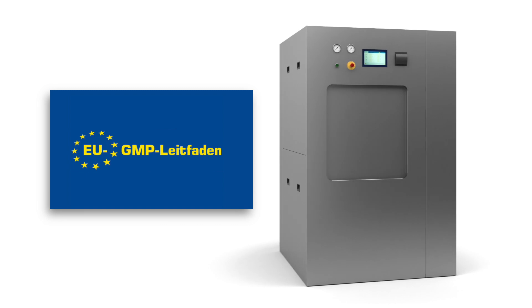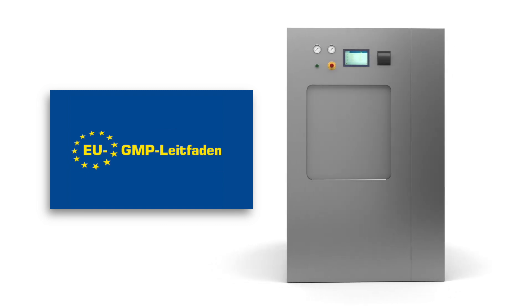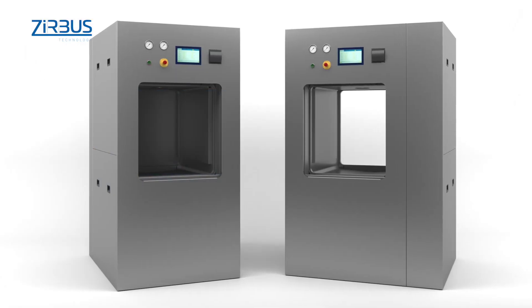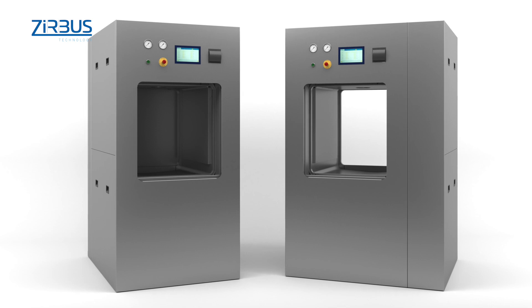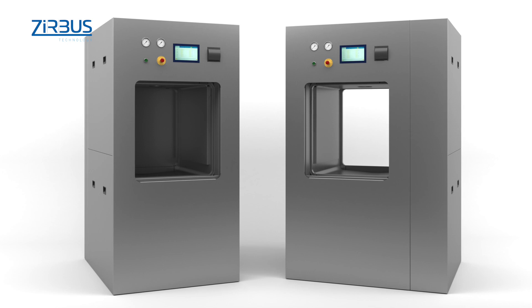GMP-compliant qualification is available upon request for the optional GMP version. Like all floor standing autoclaves from ZIRBUS, the HST669 is available in either a single door version or as a pass-through model, including wall installation with a bio-seal barrier.